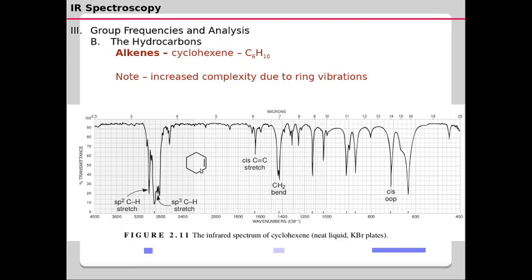This double bond can undergo a kind of vibration, as this part is in a cis configuration. And this typical band is due to the CH2 bending vibration. You have four CH2 groups here, so they could bend out of the plane, and this bending vibration could give rise to this typical medium intensity band.